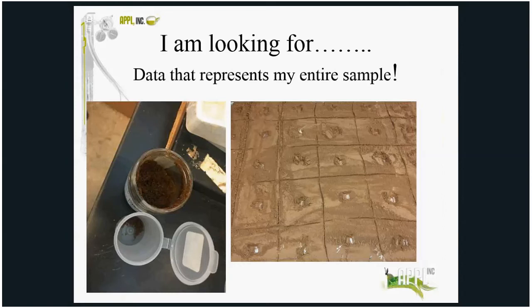It's necessary to have the proper equipment to perform the sampling processes for MIS. A variety of equipment is necessary, including large trays, bakery racks, balances for large samples, a variety of 12-inch sieves, temperature and humidity controlled room, plenty of hood space, as well as table space to process large sample volumes.